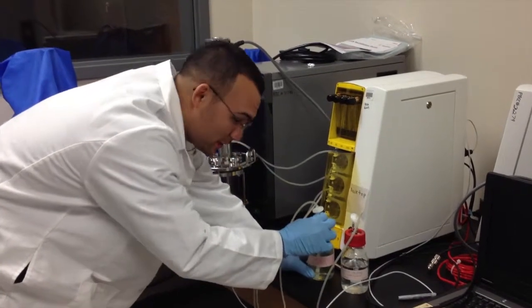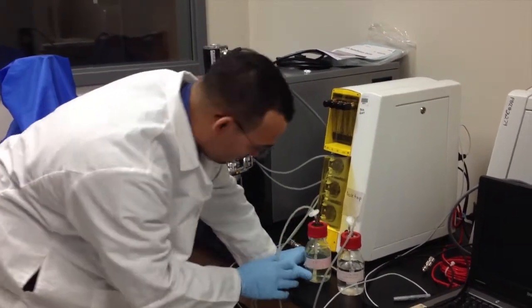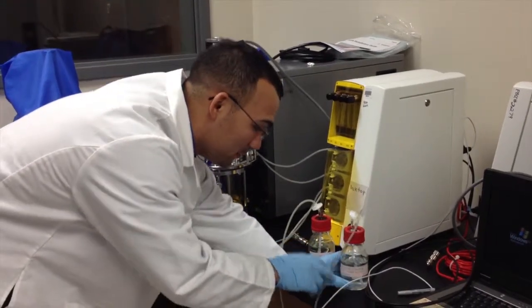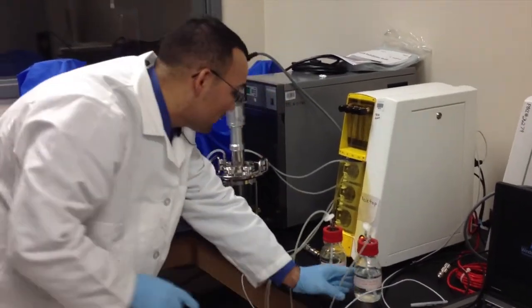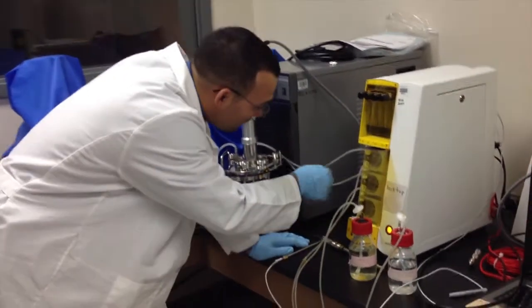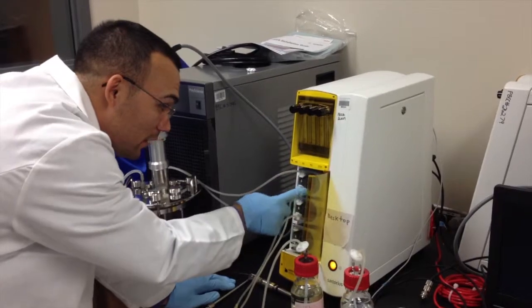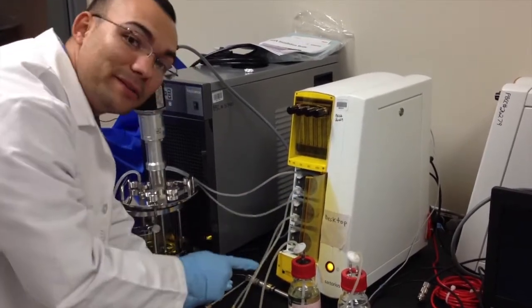We just finished connecting our acid and base tubes. For our acid, we're using 1 molar hydrochloric acid. And for our base, we're using 1 molar sodium hydroxide. Easily just match the tubes according to the acid or base and follow the arrows according to the acid or base. Real simple.